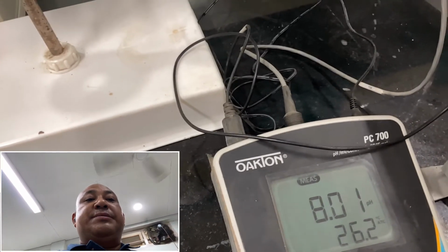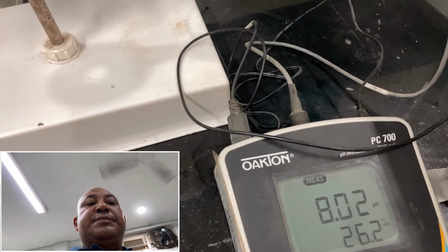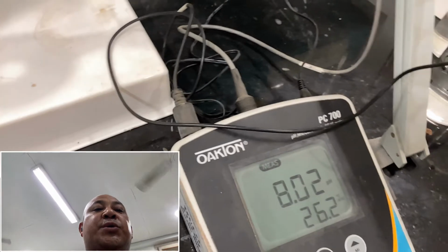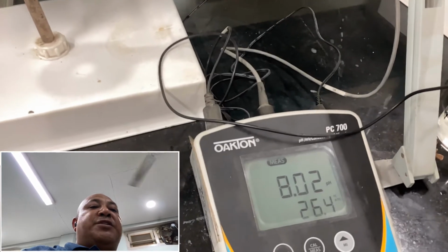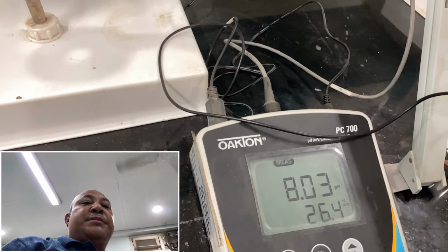My goodness. Now the fluctuation is very, very small. 8.02, it's not moving for a long time. Okay, let's go for the next sample, please.